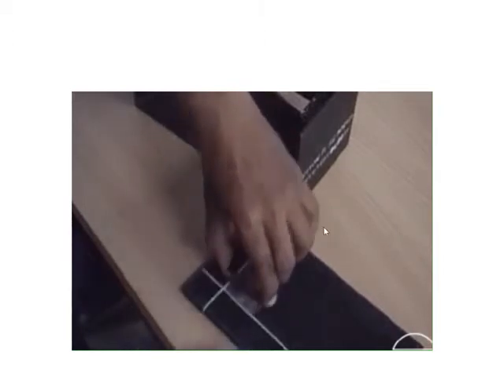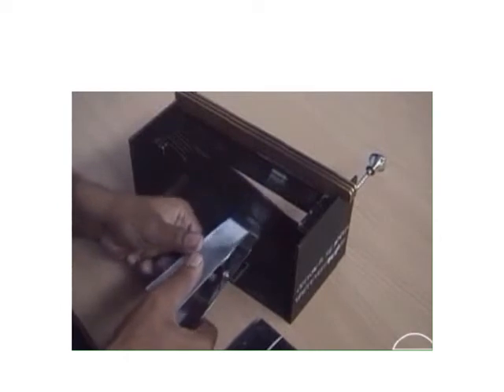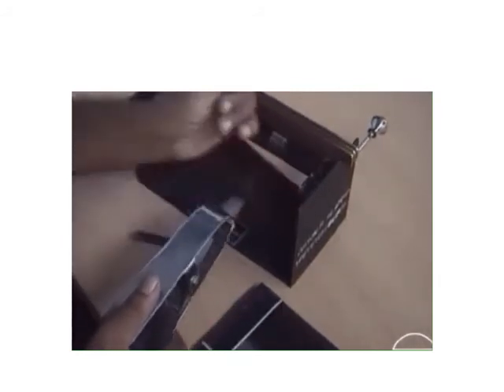See, carefully and slowly and without any crimp, the fibers are placed. Since it is a velvet pad, it will not again form the crimp. The fibers will be straight. Similarly, all the fibers are taken and arranged in descending order.